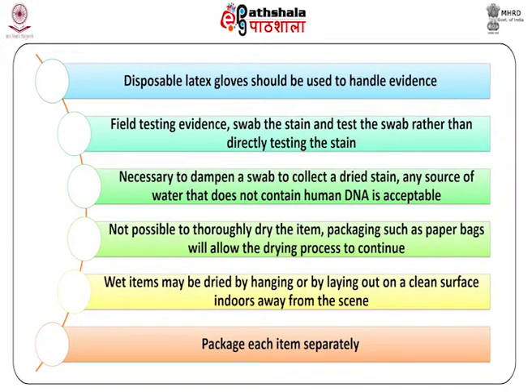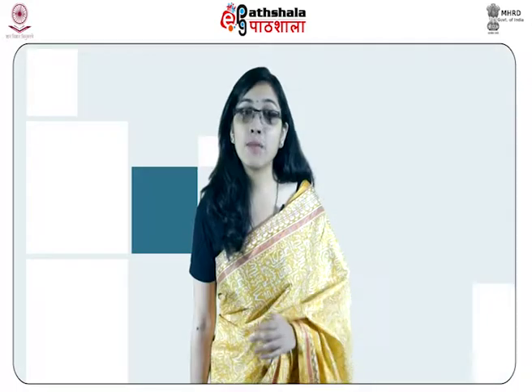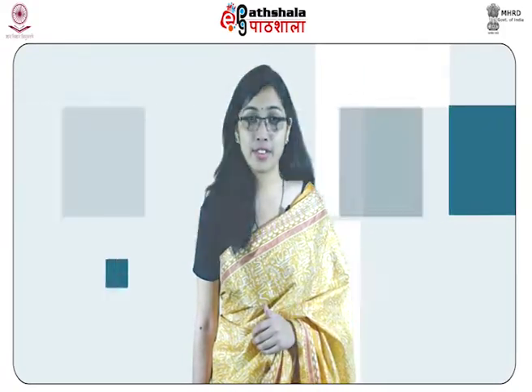Dry damp items and swabs. When it is not possible to thoroughly dry the item, packaging such as paper bags will allow the drying process to continue. The wet items may be dried by hanging or by laying out on a clean surface indoors away from the scene of crime. Package each item separately. Other biological samples are also collected in the same manner.